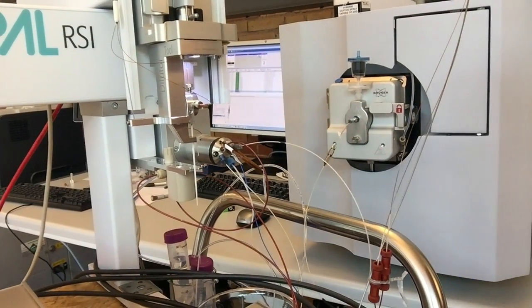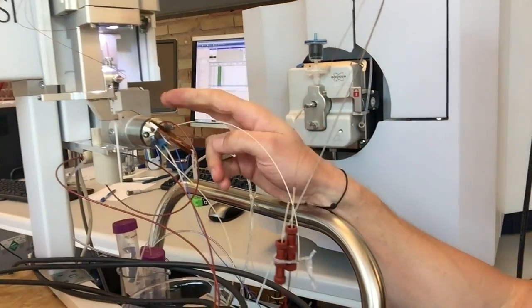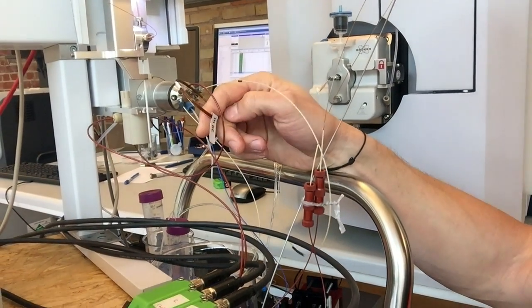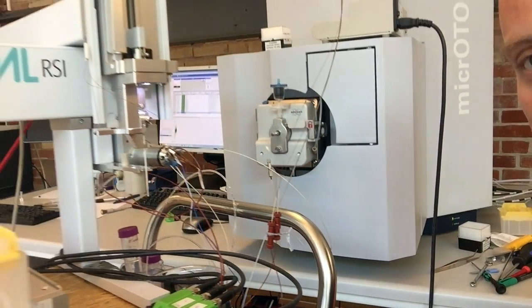We are using a ceramic needle instead of a stainless steel needle. This would be our loop valve, and you can see that we are currently running with a 30 micro-liter loop. And all of this is now hooked up to a Q-Tough instrument from Bruker.